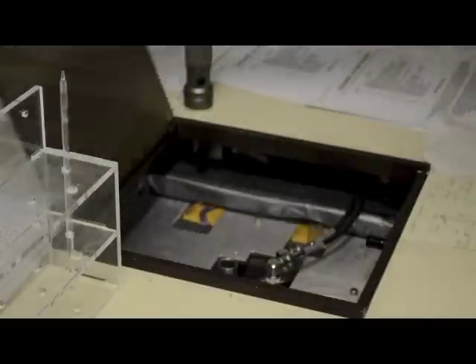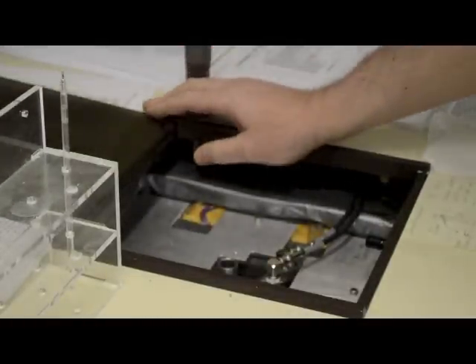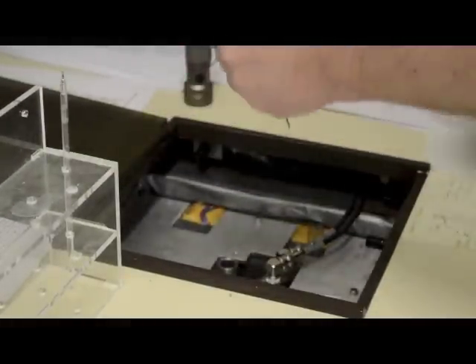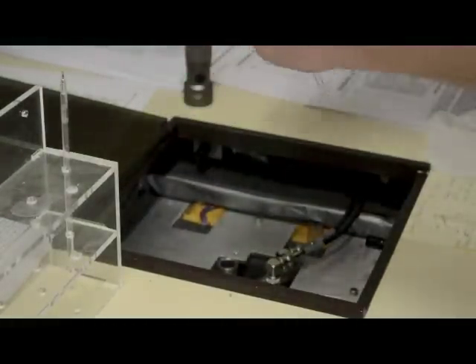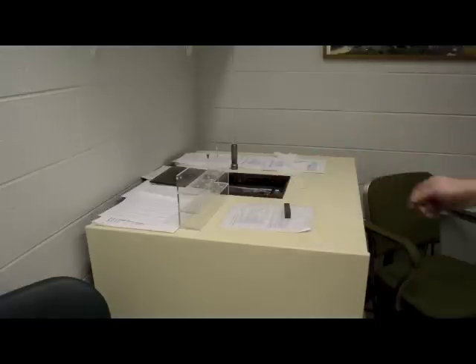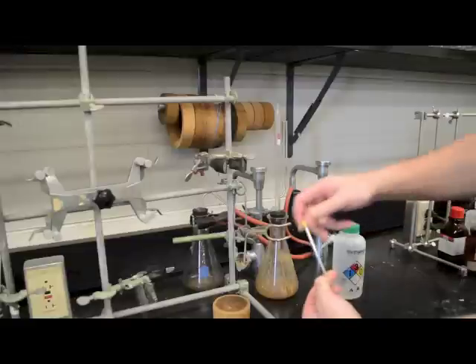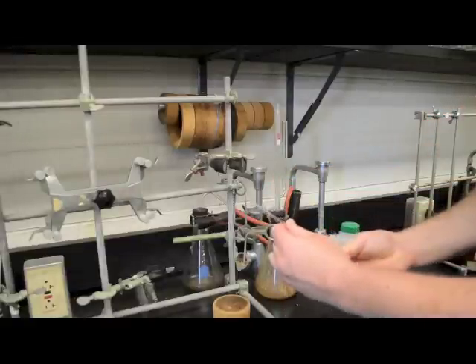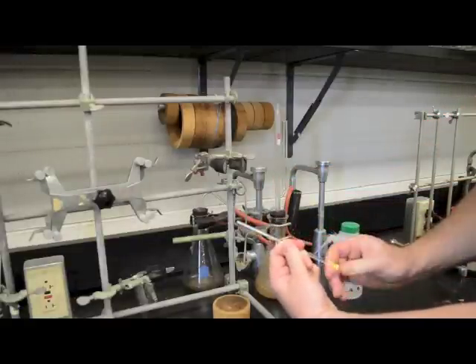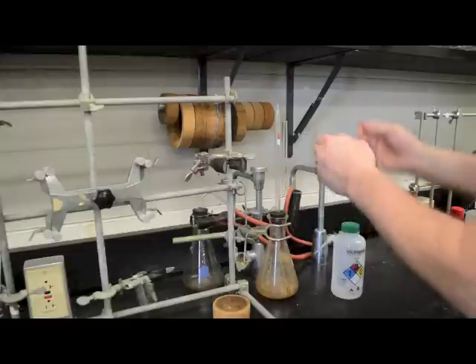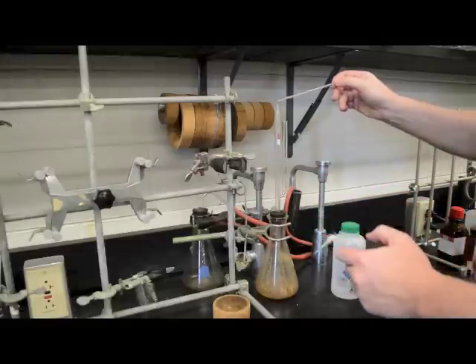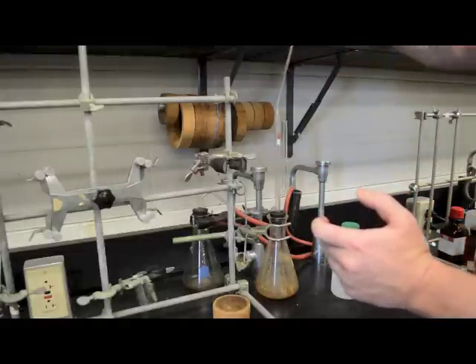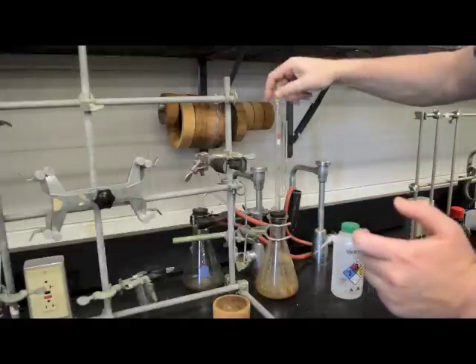The last step is clean up. Take your NMR tube out of the instrument and carefully place the spinner on top of the instrument. Go to the NMR tube wash station which is on the east wall of the research laboratory. Remove the top of the NMR tube and place it on the bottom of the tube. Now, carefully place the open end of the NMR tube in the NMR tube washer.